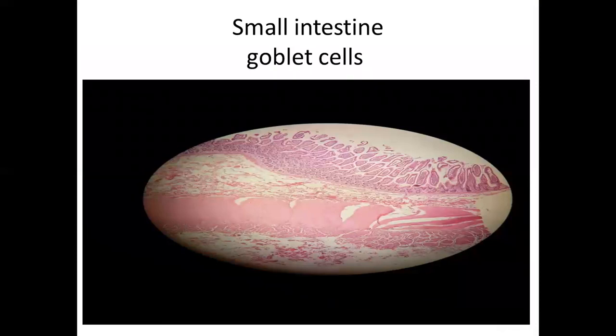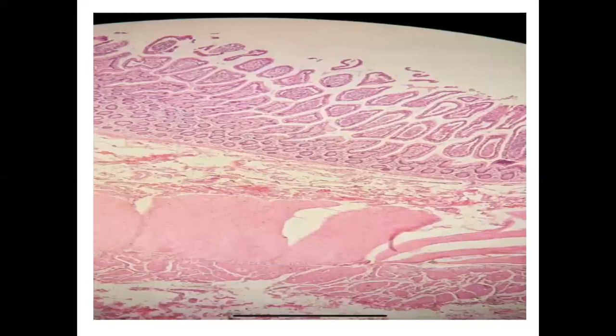هذا سلايد آخر مسمينه هنا goblet cell. Also هو small intestine. مسمينه goblet cell. That's regarding a clear presence of goblet cells. هذه اللي تشوفها النقاط البيض أو الفارغة، هذه هي goblet cell. تمام، هذه هي goblet cell. The main characteristic cells that are located at the small and large intestine، واللي راح تجي تزيد at the large intestine أكيد.